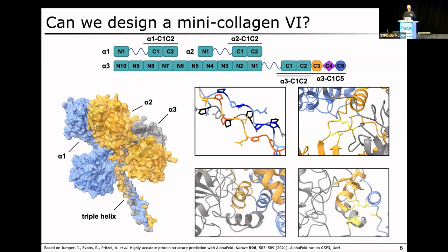And looking at the center of the protein, so that will be down here, we found this 3 helix bundle where all 3 chains come into contact, and they're actually also disulfide linked. And so we thought maybe this is the recognition motif that ensures that in nature you always end up with a 1, 2, 3 assembly, or 1, 2, 5, 1, 2, 6, but never a homotrimer.